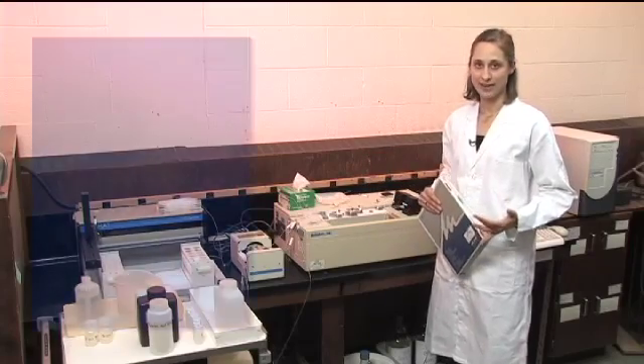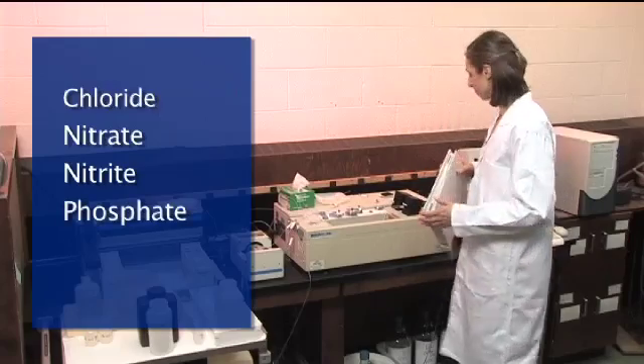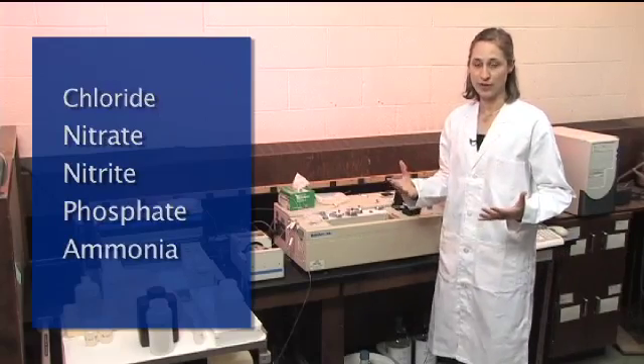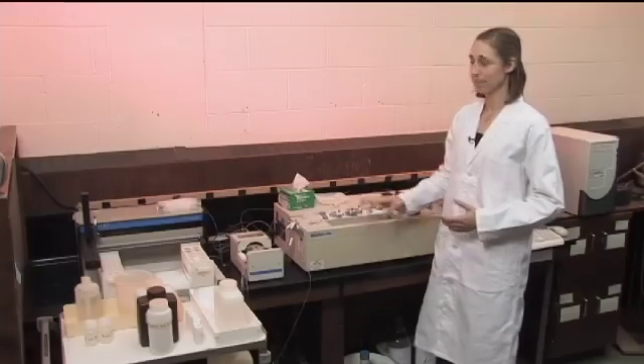Some common things that you analyze for are chloride, nitrate, nitrite, phosphate, and also ammonium. For example, if you had done a CEC extraction and want to analyze for ammonium, you can do that on this instrument. The same basic procedure applies for doing any analysis on this instrument, but just to provide an example, I'm going to do orthophosphate for a Bray extract, which is estimating available phosphorus.